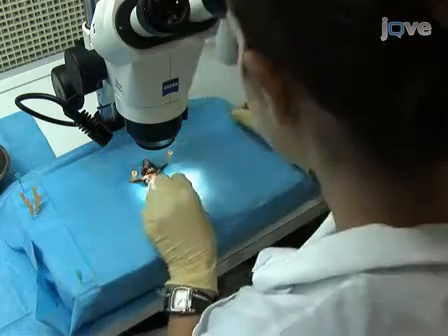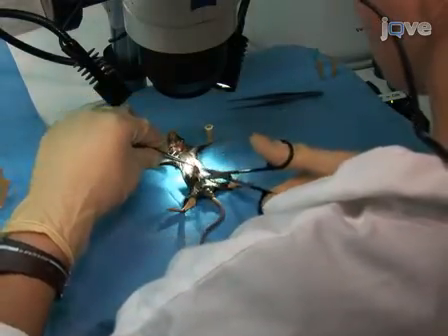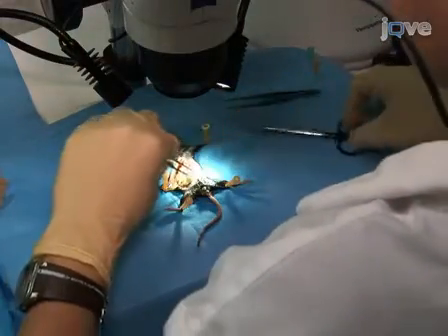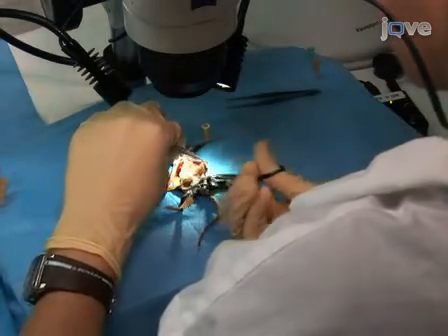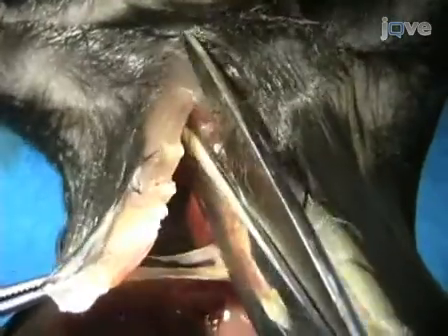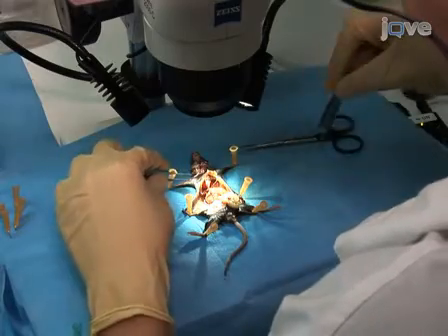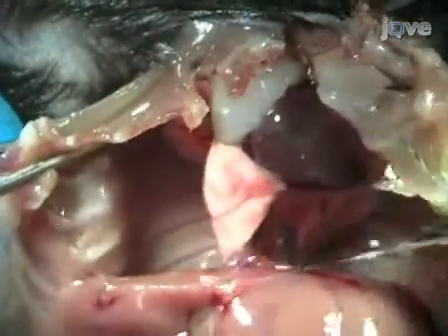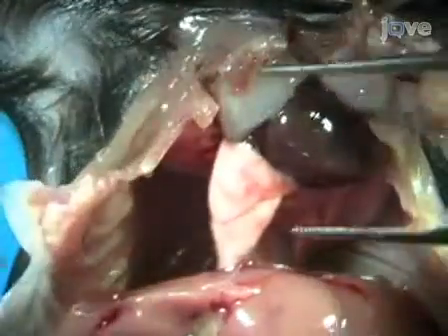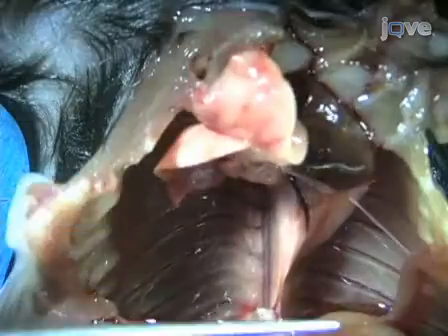Next, while working under a dissecting scope, use sterile forceps and dissection scissors to perform a vertical incision of the skin and open the peritoneal wall. The incision should be made to expose the upper sternum, where the ribcage is also cut and the diaphragm removed. Proceed to carefully push all the organs aside, completely exposing the thoracic aorta, located alongside the spine.